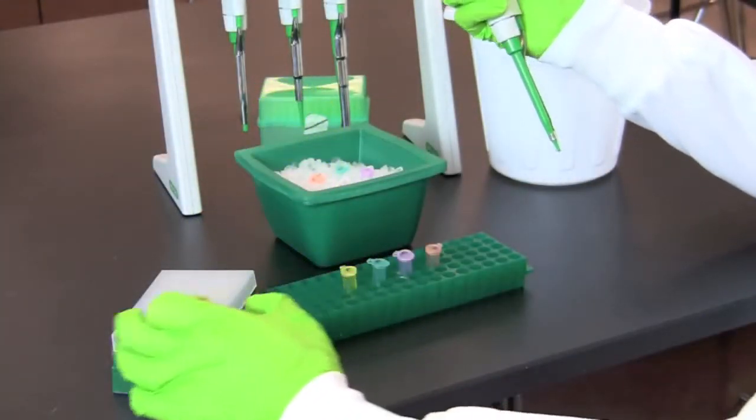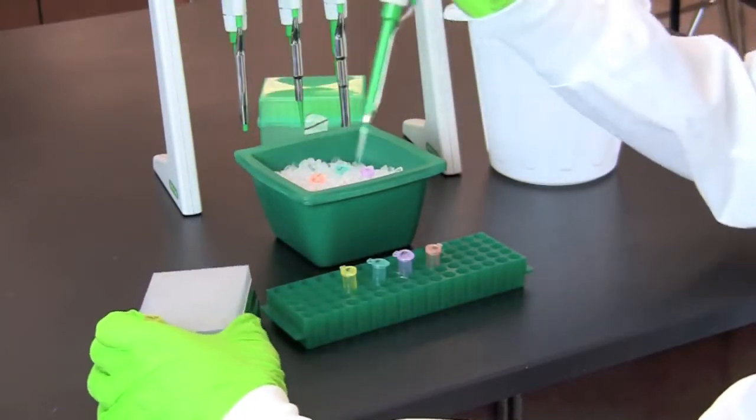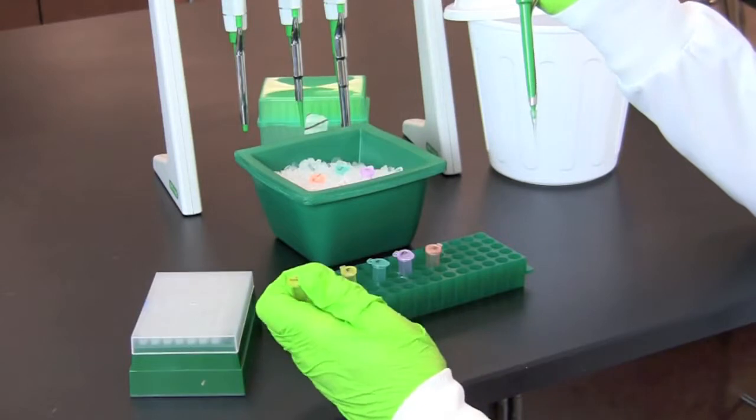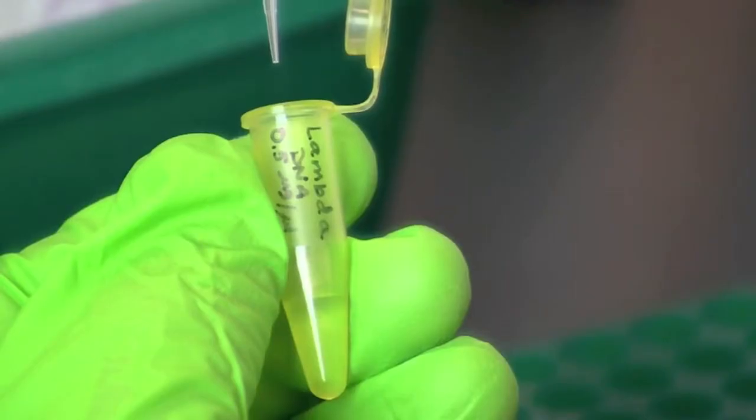Start by loading each of the colored tubes with lambda DNA. Using a fresh tip, transfer four microliters of lambda DNA from your stock tube to the color-coded L tube.